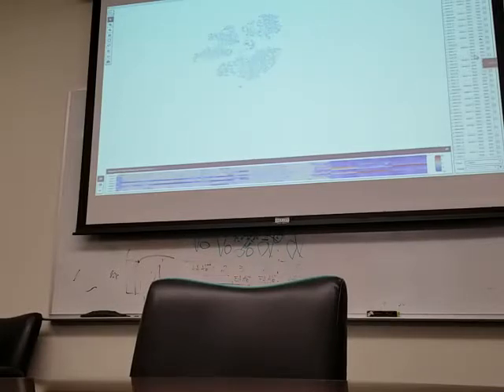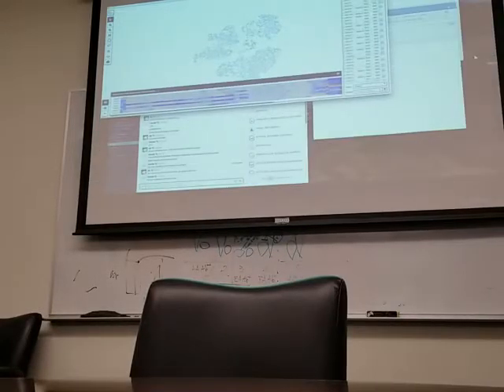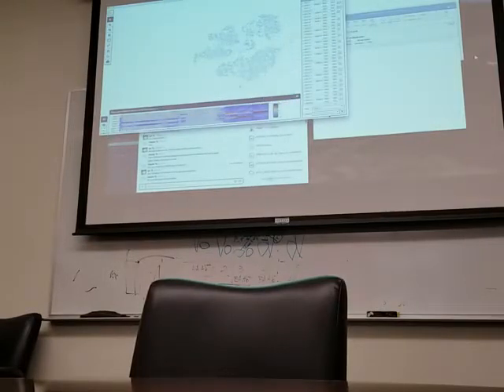We're sort of dealing with this from a different perspective on another project. We're working with somebody, and we're going to do 10x, and the question was that we may only get 400 cells, and the question is, can we see expanded lineages in that?